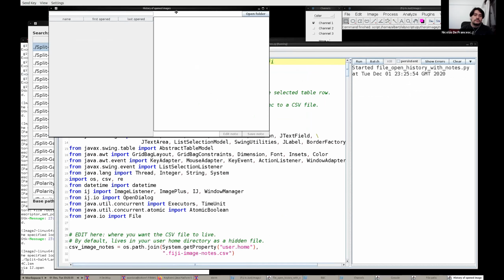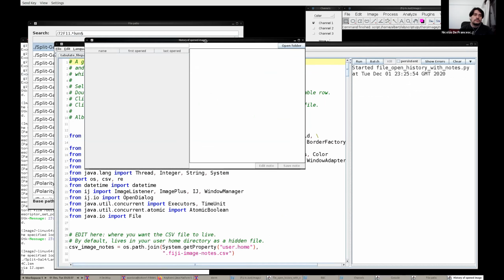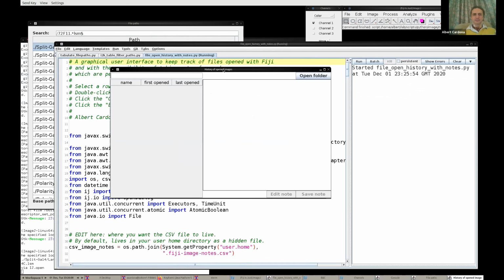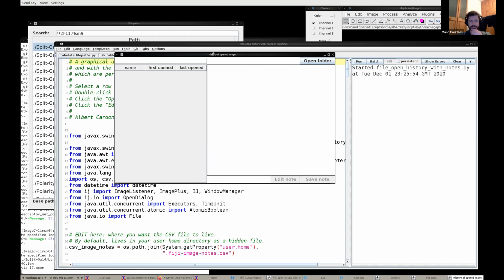So what does this do? Here I've created another user interface. I'm going to make the font a bit bigger so that things become clearer. And you all guys can hear me, right? Because everybody's very quiet. Yes. Yes. Good. Thank you. And we see you as well.